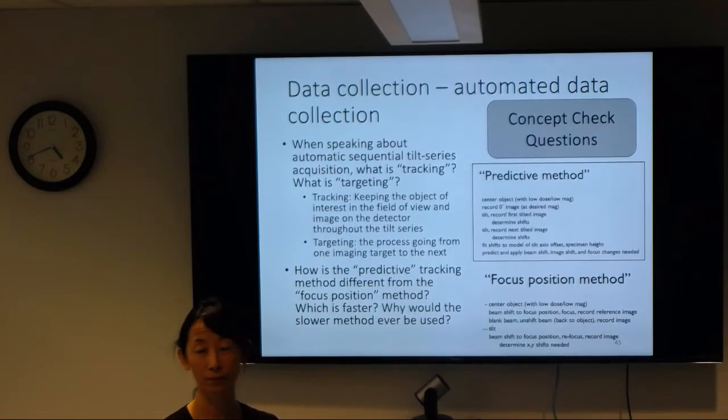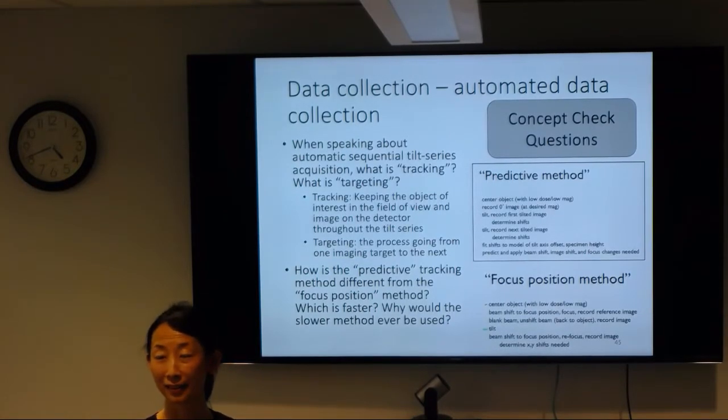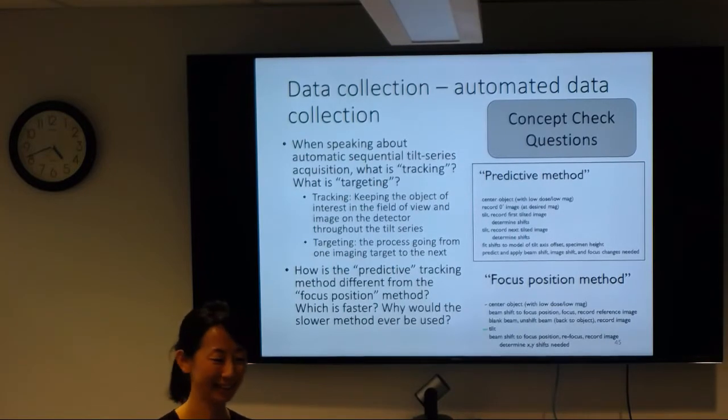We collected tomograms on the F20 all the time. And you were like, oh, how did this work? It's rare. The TF20 is a Gatan 626 side entry, and you use Leginon, and it worked. Yeah. It depends on which holder we use. Some holders have a crazy option.